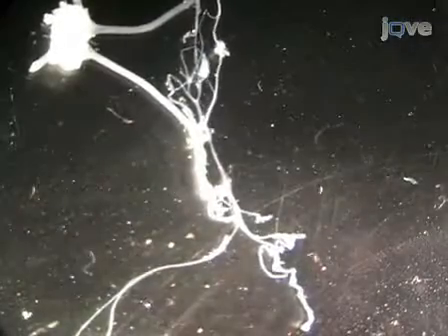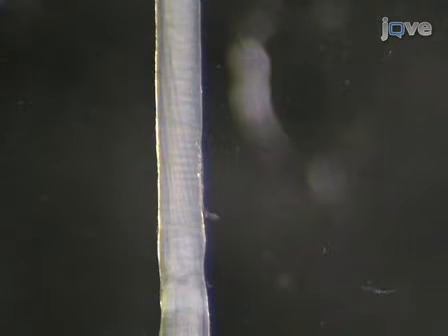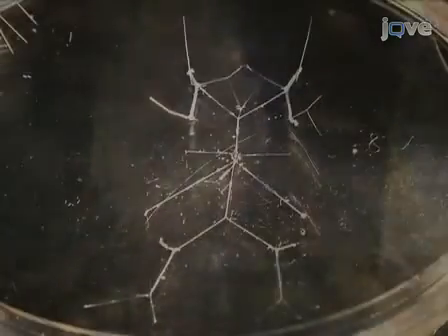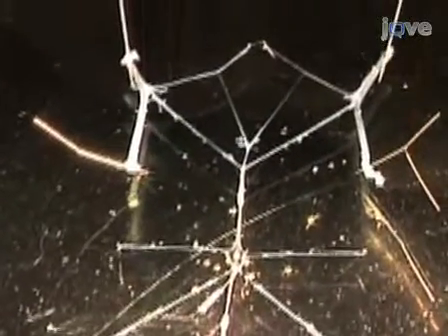Ideally, all of the nerves should be free of nicks and damage, particularly the ones you will record from. None of the nerves should be tangled or twisted. The STG should be intact with all of its cells arranged in a beard formation around the neuropil. The STNS is bilaterally symmetrical and looks like a homunculus with the LVNs as the legs, the MVNs as the arms, and the anterior end as the head.